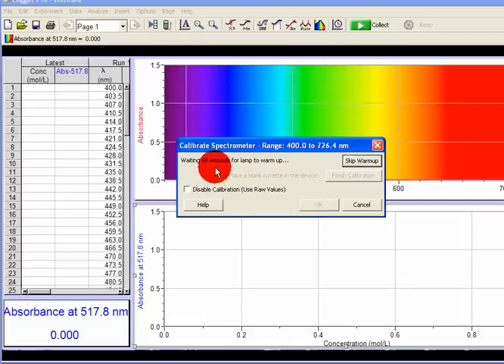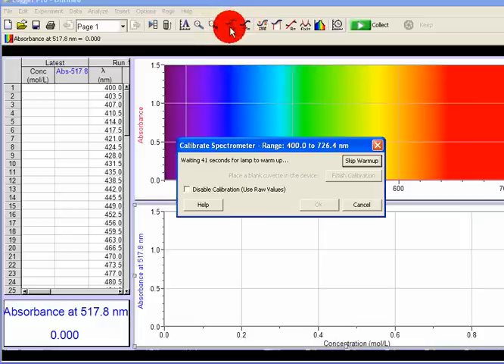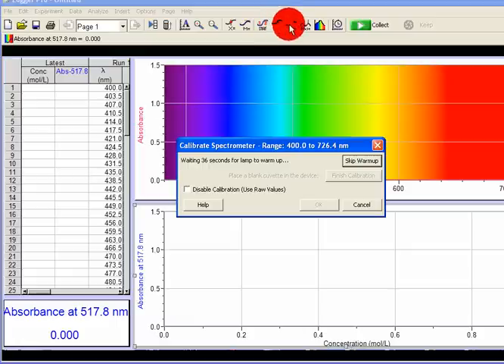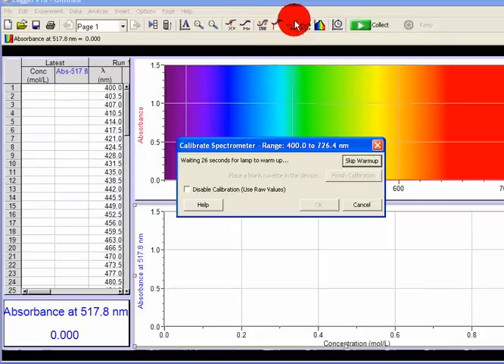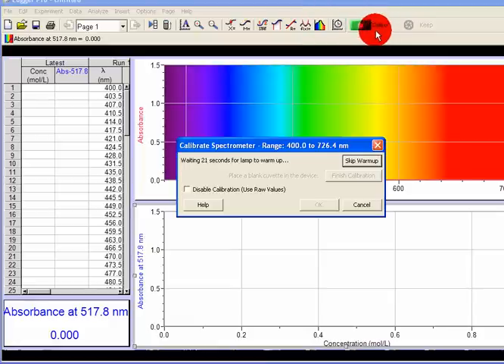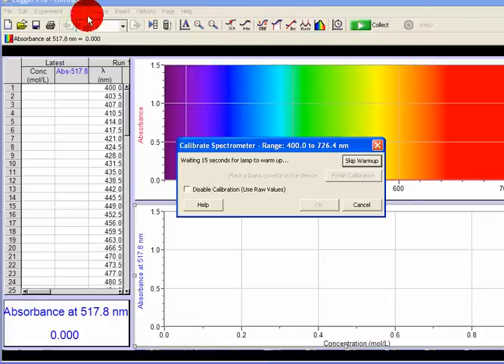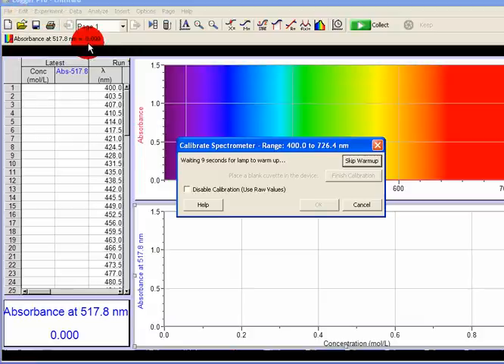While the machine is calibrating, I'll go through certain icons. This is the Examine button. This is Stats. This is the interval that we can select. And this is the one we will be using, which is Linear Regression or Regression Analysis. This will come up with our standard calibration curve. This is the Configure button, this is the Collect button, Collect and Stop, and this is the Data Collection. This part here will be Experiment, and we can save our runs under File. We have now calibrated the spectrophotometer.